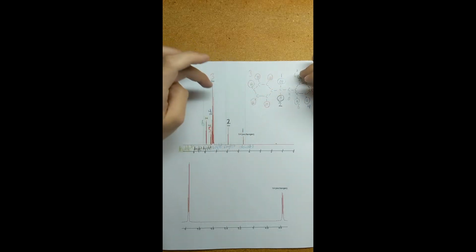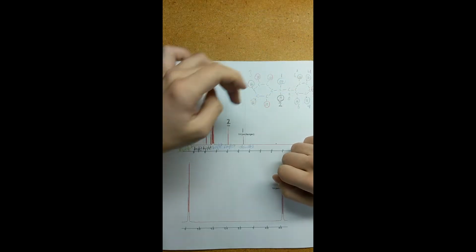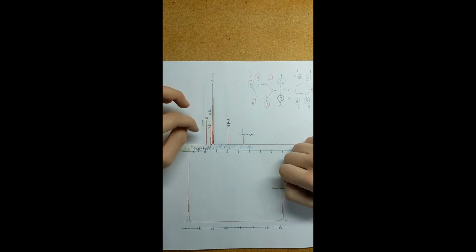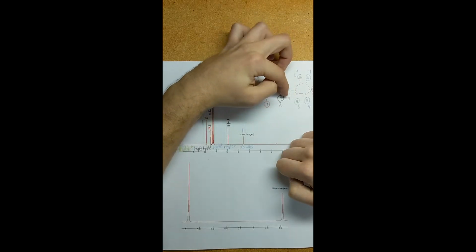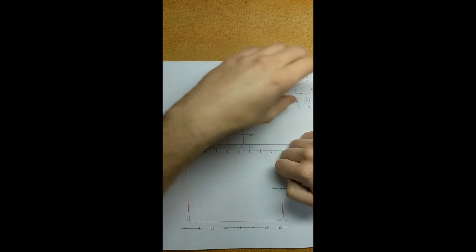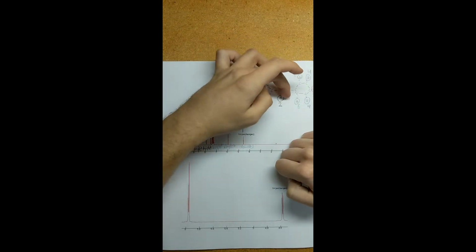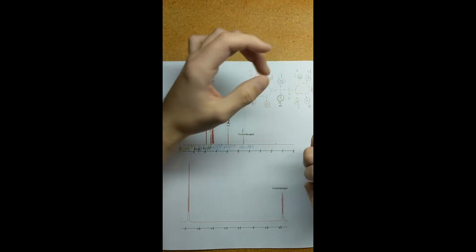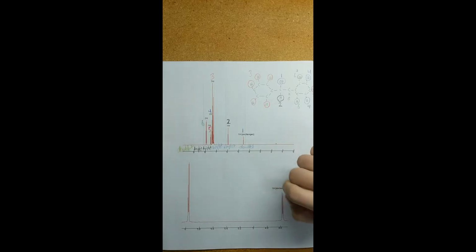This aromatic has to be in this aromatic region, as well as the hydrogens in this aromatic are also in the aromatic region, but they're separated appropriately due to their closeness to this double bonded oxygen, which is extremely electronegative. So due to these two aromatics and this hydrogen being in the center of them, even though it is close to this double bonded oxygen in theory, this is where it must end up.